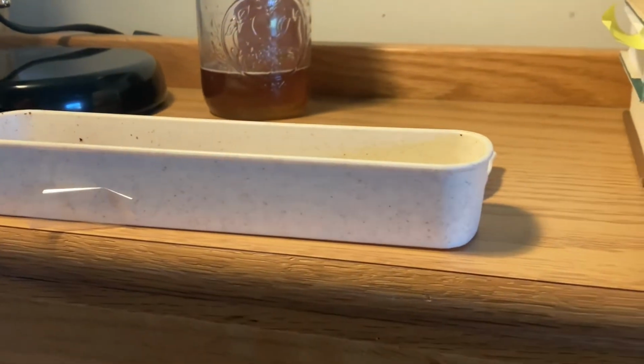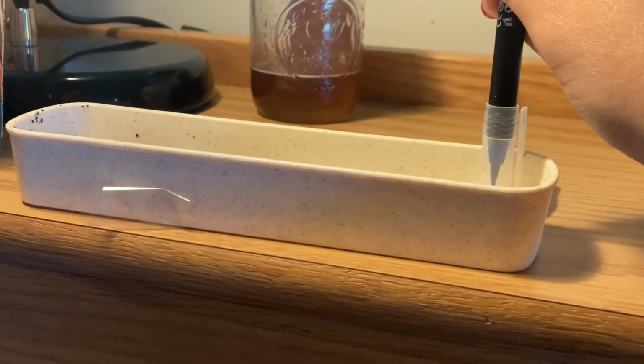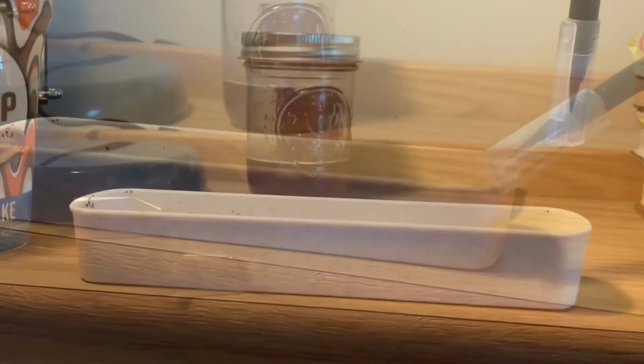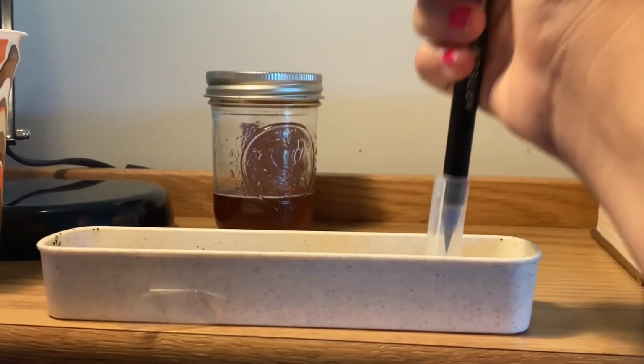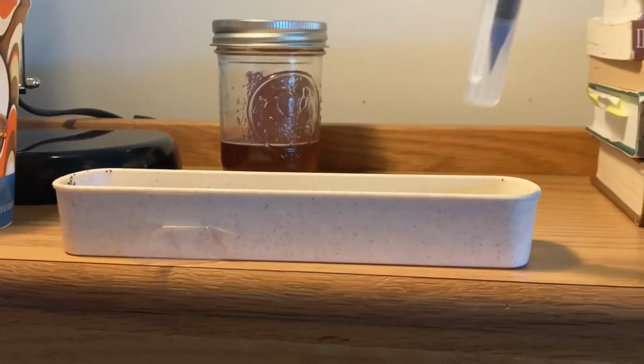When placing your tips onto the pipette, you want to make sure you press firmly, but not harshly, to insert the tip onto the pipette. You want to make sure to do everything as efficiently as possible to decrease the risk of contamination.